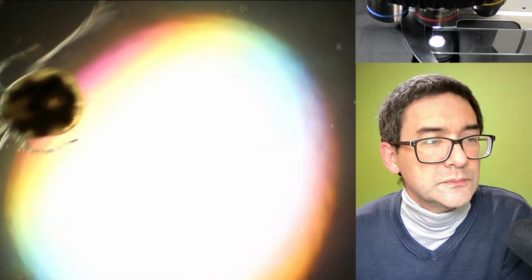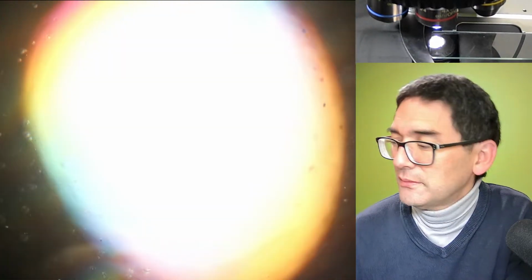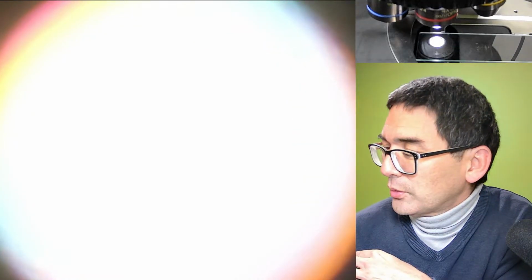Where is it now? Yeah, here it is. Now it's able to move again. Okay, so that's the mite. It's still doing fine. Then number 1, number 2. So let's see what this guy is doing here. That is the flatworm from before.